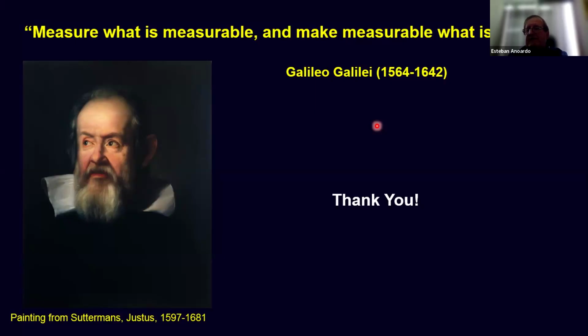And the other point, Danuta, it depends quite a lot on the dimensionality of the problem. If you have only 2, 3 variables, this is not a problem. Usually you will get a good fitting once. But again, you should know that the model is validated. This is an essential point for me. So it's logical.